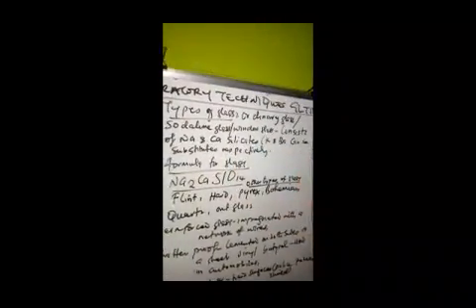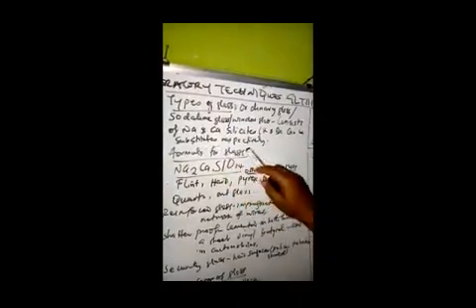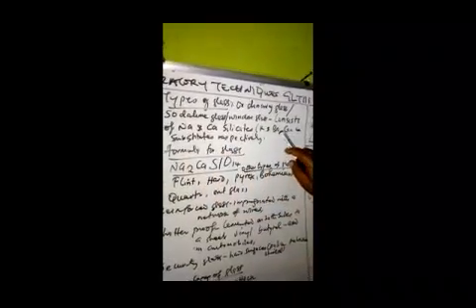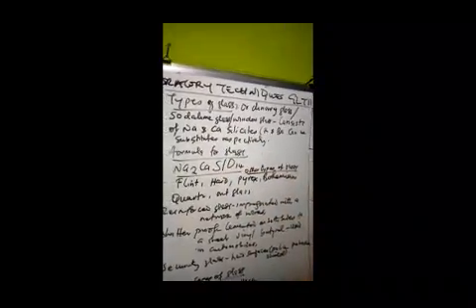Then what are the types of glass we have? We have ordinary glass. Some people call it soda lime glass. Others call it window glass. This glass consists of sodium and calcium silicates, as we have said. Potassium and barium can be substituted respectively. That means using potassium to substitute for sodium and using barium to substitute for what? Calcium. That's why I say can be substituted respectively.